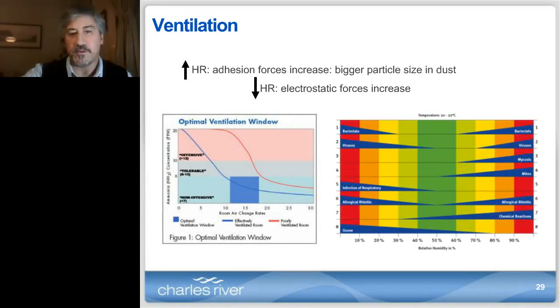the ventilation parameters, in terms of temperature and humidity, and what they should be. If you see here this chart on your left, again it is very small, but this is the concentration of ammonia, and these are air changes per hour. The fact that we tend to fix air changes per hour at 20 is simply because we guarantee a nice, non-offensive environment in terms of ammonia at that level of air changes per hour. So the non-offensive level will be around here.